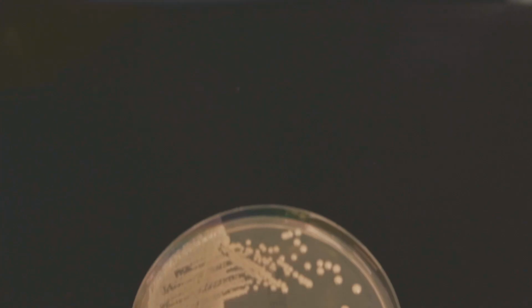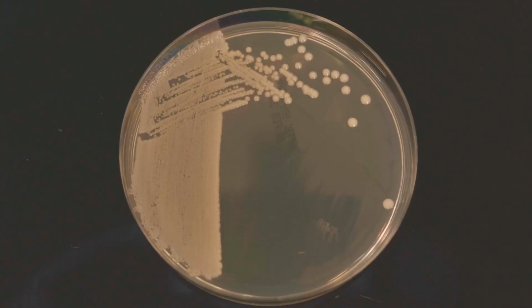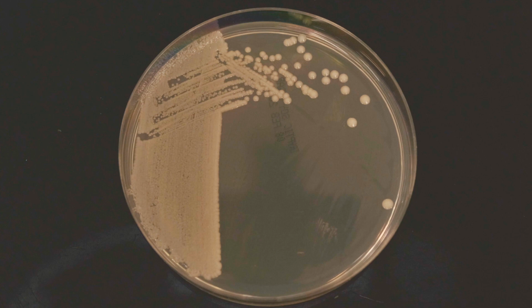Here we see what the results look like after a period of incubation. Notice that individual colonies are visible towards the last few sets of streaks. These colonies are isolated and can be picked for further analysis.